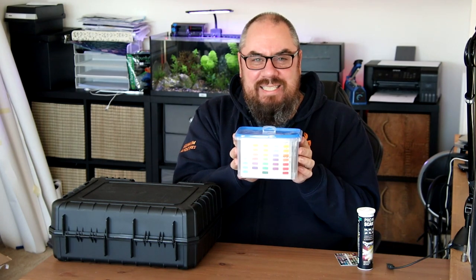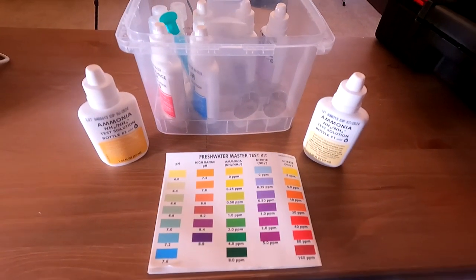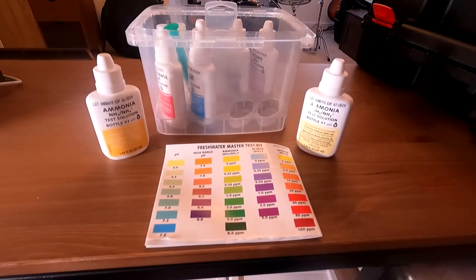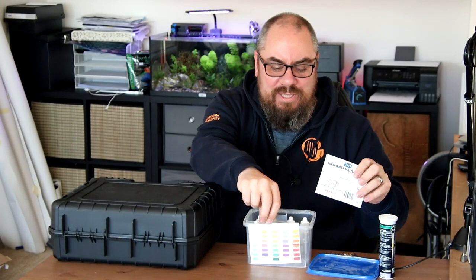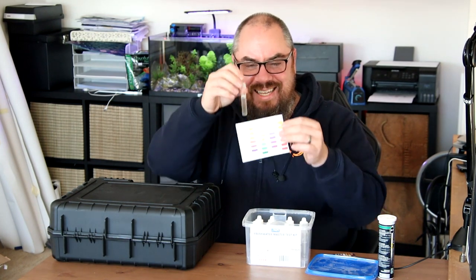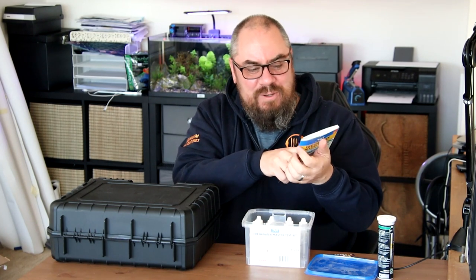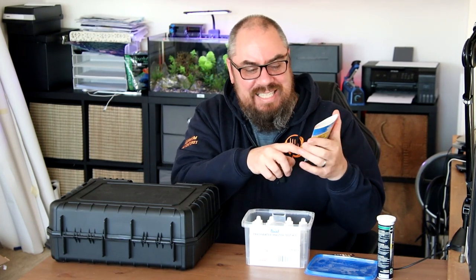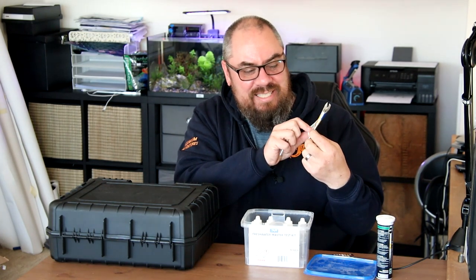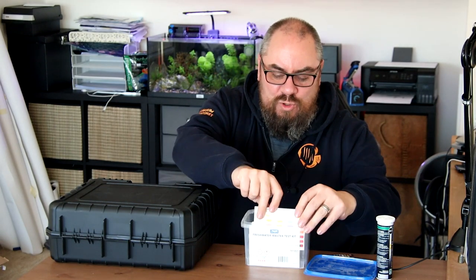A step up from that is something like the API Master Kit. You take a sample of water in your test tube, add some reagents to it, give it a shake, wait a while and compare it to a colour chart. And that's where the problems can often begin — especially if you're someone like me who's completely colourblind, you often struggle to compare one colour against another. The 10 and 20 parts per million options of the nitrate test look almost identical to me.